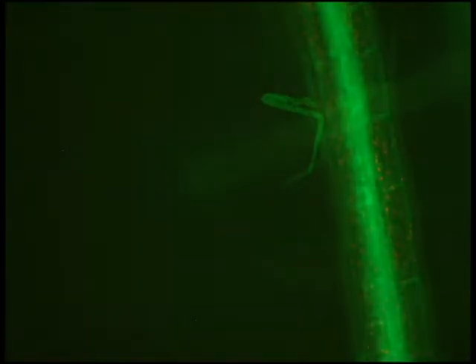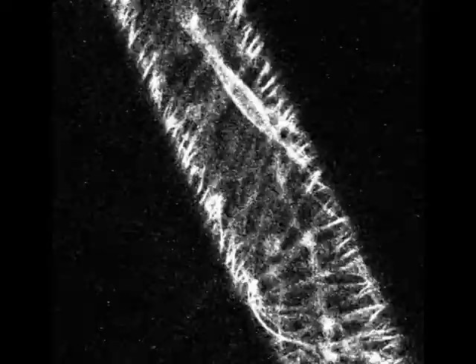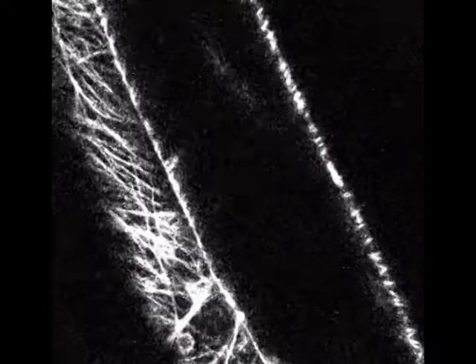Here we see tubulin fluorescing on its own because of a modified gene allowing it to fluoresce in blue light. Now we'll take a look at these fluorescent images as they've been processed to create a 3D image. Here's our finished 3D image colored to help you see its dimensions.